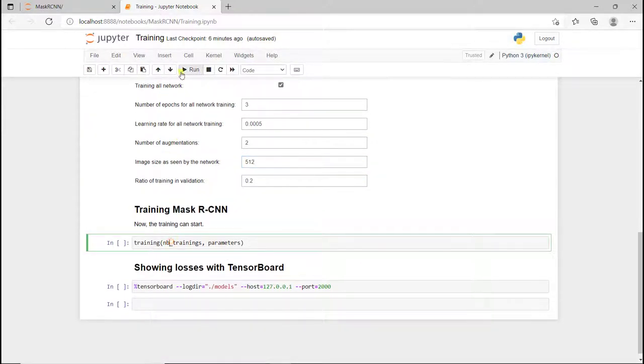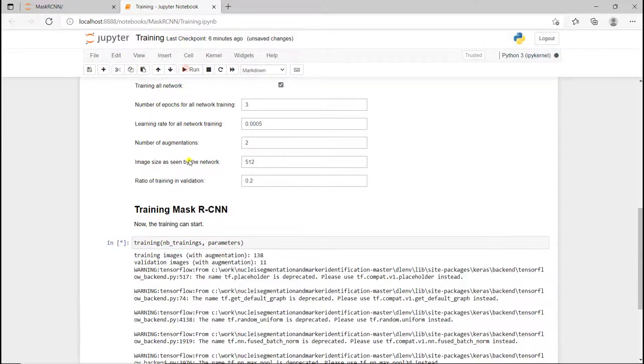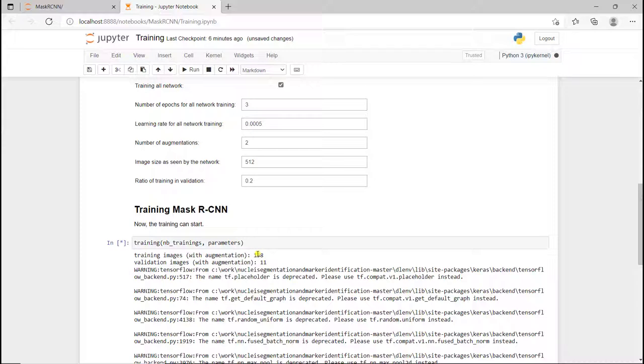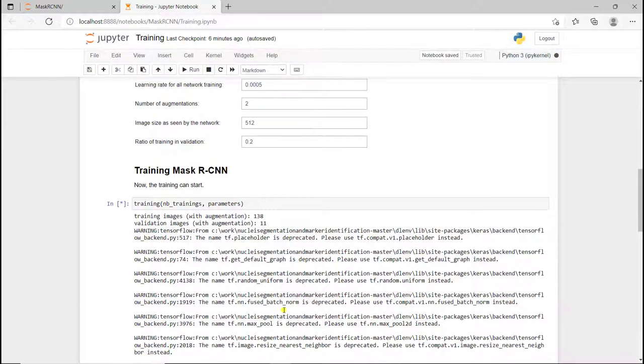Now I'm going to train my Mask R-CNN model. So you see, I think it's 44 images at the beginning. When you have 2 augmentations, it's going to be 44 plus 44 times 2, where we apply data augmentation.